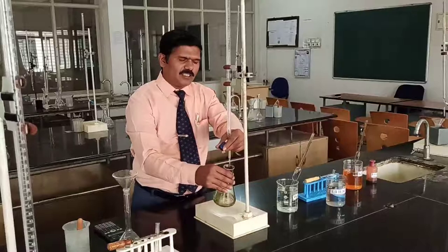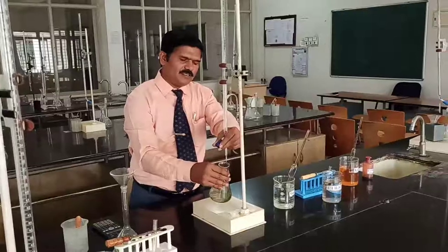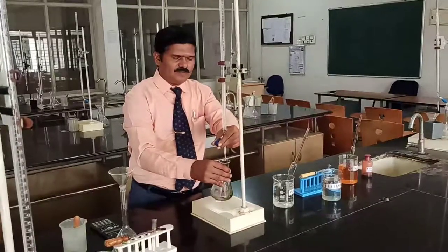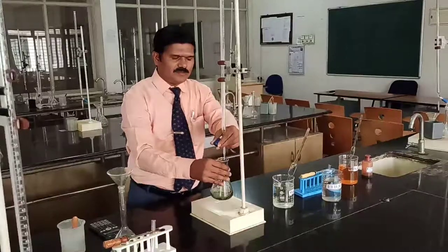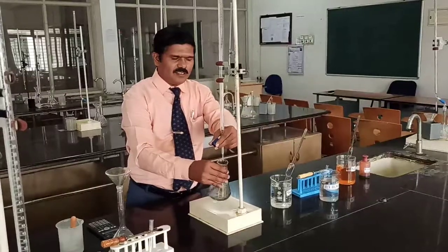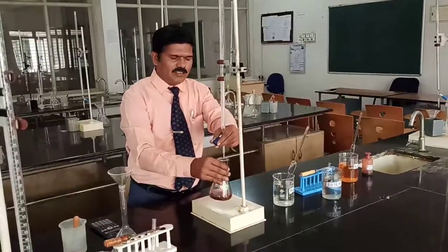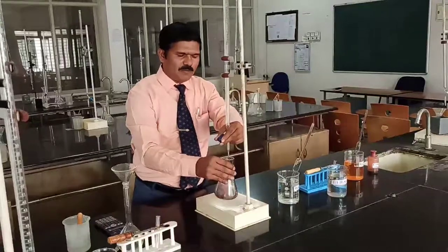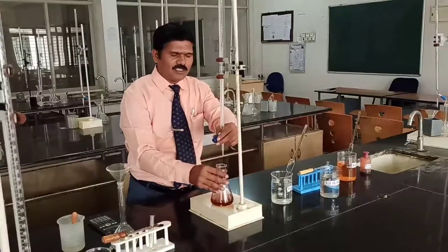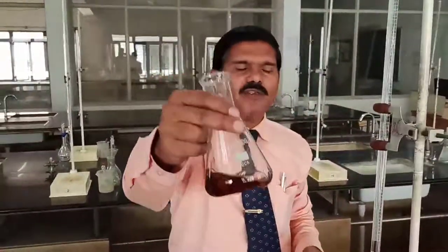If you can see, now the solution is slowly changing to bluish green. When you reach the end point, you have to add very carefully, drop by drop — add one drop and shake it well, add another drop, shake it well, and stop adding when the solution reaches reddish brown color. This is the reddish brown color. This is the end point of the reaction.